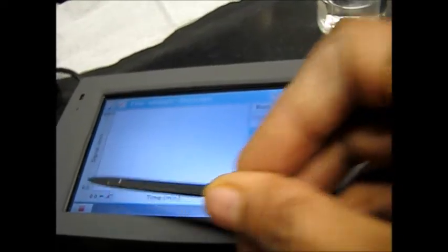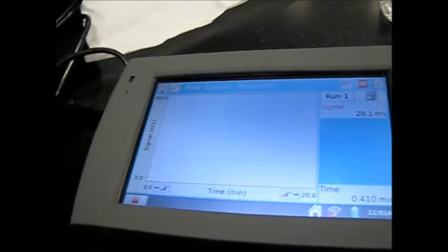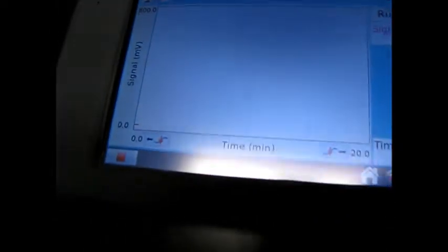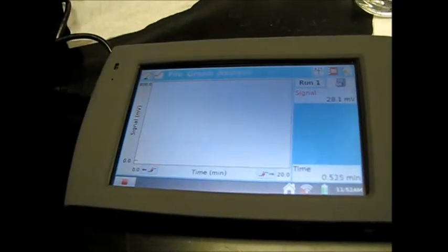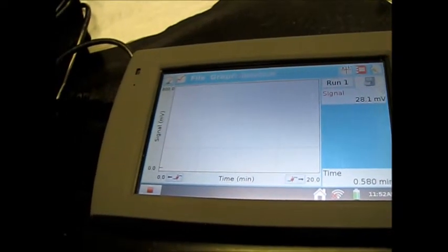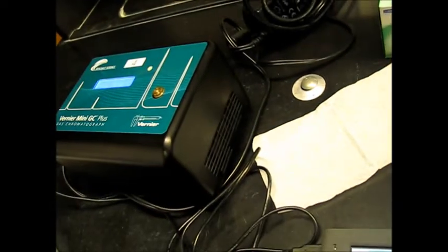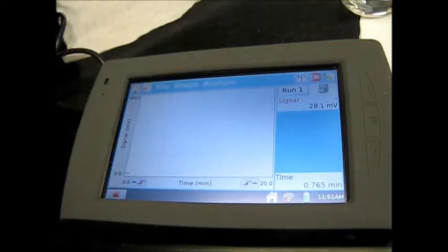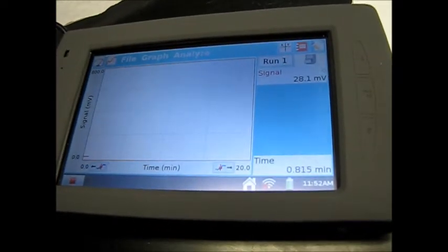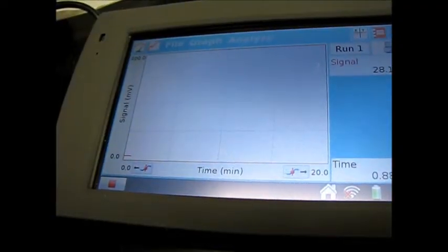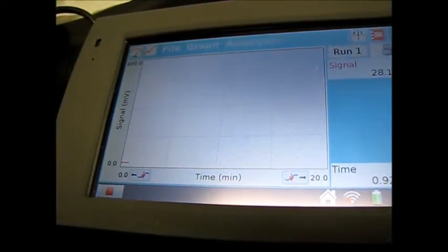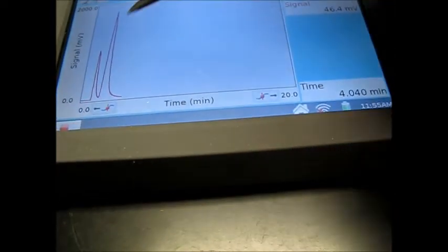Now just that you can see. The sample is coming. So it takes at least 3 to 4 minutes to run the sample all the way in the GC and to appear in the LabQuest, you have to be patient. So this is after 5 minutes, here you can see in the B portion, we have more second peak than the first peak, now it's time to stop.